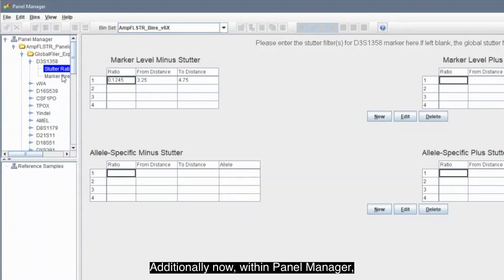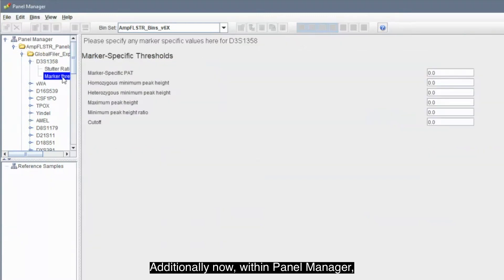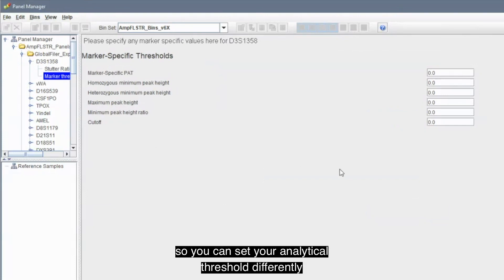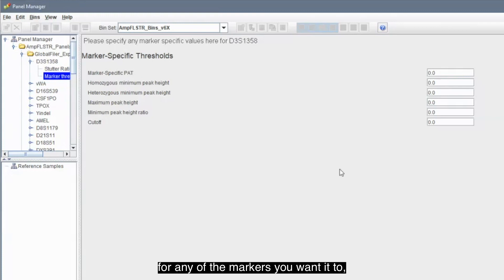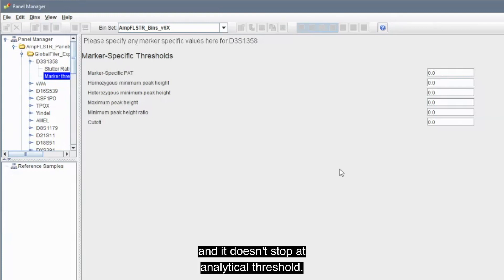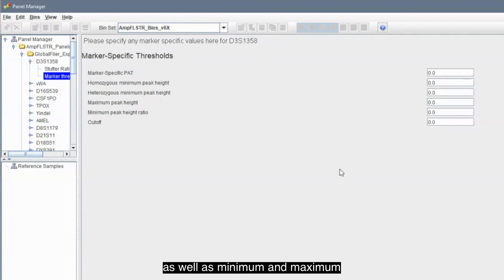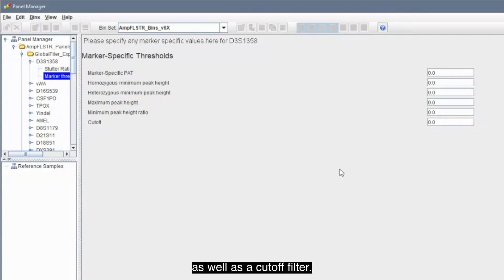Additionally, now within Panel Manager, we have that ability to set marker-specific threshold. So, you can set your analytical threshold differently for any of the markers you wanted to. And it doesn't stop at analytical threshold. You can set different PHRs for your markers, as well as minimum and maximum hetero and homozygote peak heights, as well as a cutoff filter.